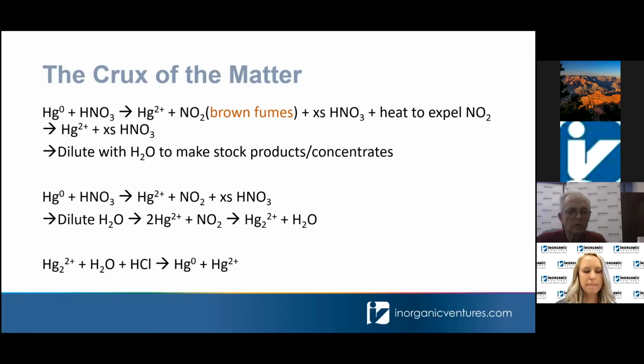So what we're dealing with are situations where your mercury in your sample or in your standard bottle is getting reduced and then forming the diatom. The equilibrium is such that it's about 1,000 times more wanting to form the diatomic mercury than to be the free mercury. So you've got a thermodynamic equilibrium that is going in that direction. But when you add ligands to your mercury, if it has any diatom, it will break it into the Hg0 and the Hg+2, the mercuric and the elemental mercury.